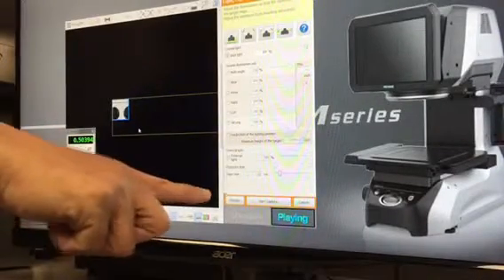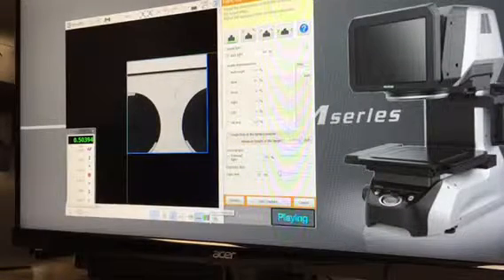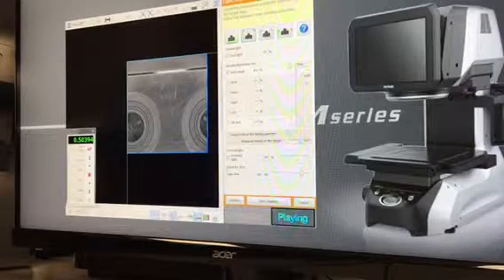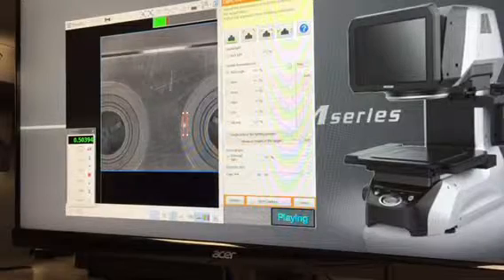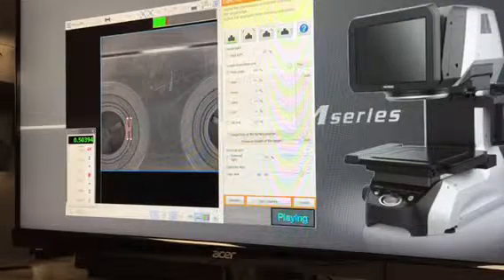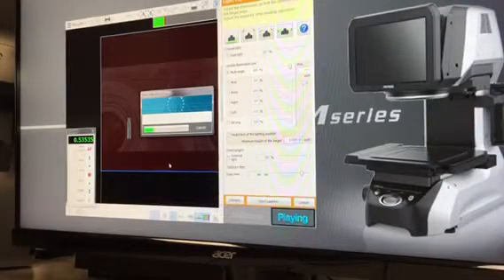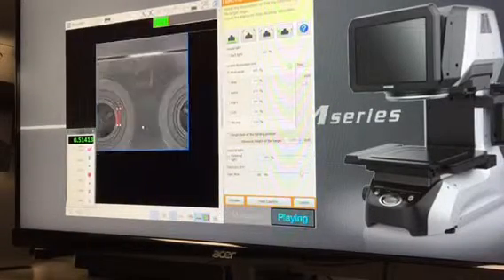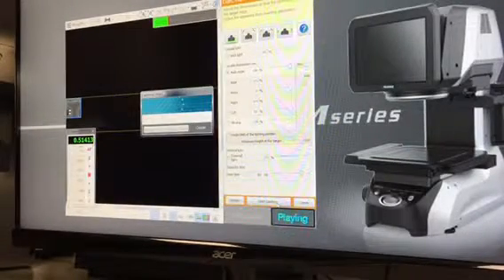And that's okay. What's this doing? What's this for? So what you want to do is make sure that you're focused right first. Okay. So you can put the top light on, and then drag this box, and we want to focus on this edge ID right here. Right now it's not showing the whole, just this particular area. So we get it focused in this one area, and then hit start capture.